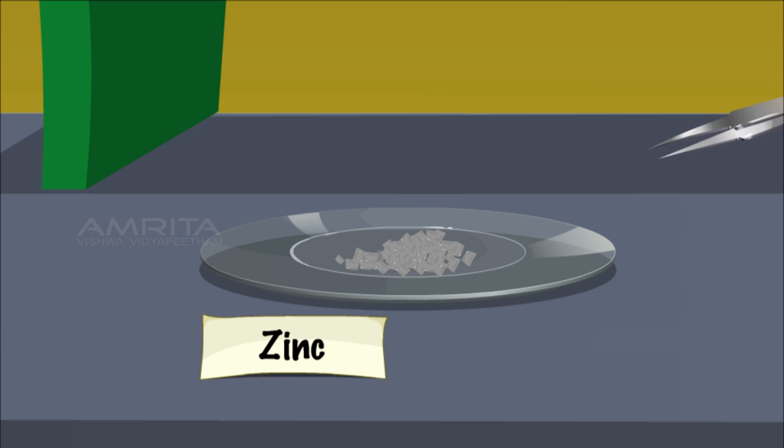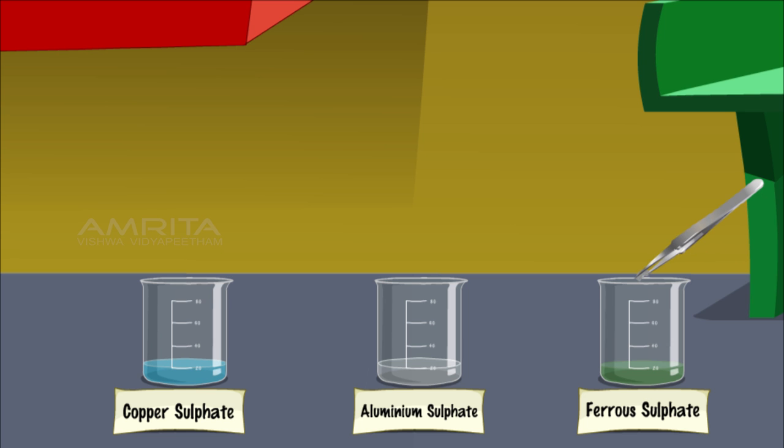Using a forceps, take some zinc metal pieces and add two pieces of zinc into the beakers containing ferrous sulphate, aluminium sulphate and copper sulphate solutions.